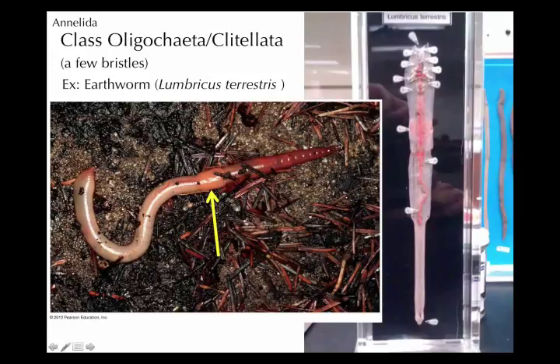These have an anterior, a posterior, and are bilateral. The anterior is closer to this structure called the clitellum. It's like this, but at the end. The clitellum is this smooth patch on the oligochaetes, particularly the earthworms, which always have it, and a number of the leeches have it as well. What goes on there is reproduction.